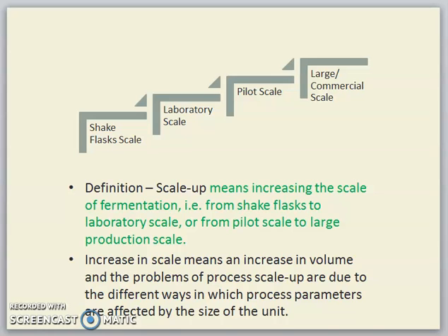Next, the pilot scale, in which we increase the volume from the lab scale into a larger volume, which is known as a pilot scale. If we succeed in the pilot scale, then we shall go to the larger scale for the commercialization. Alright, the definition of scaling up means that you have to increase the scale of the volume of the fermentation from the shake flask to the lab scale, or from the pilot scale to the larger scale for the production.